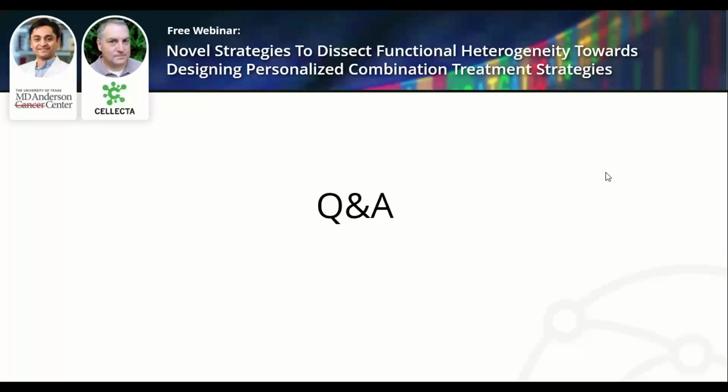That's great. Thank you very much, Sahil. So our third question is, how were the clones with specific DNA barcodes isolated from the bulk? Right. So the information we have is the specific DNA barcode for every clone. However, cells of course don't express that DNA marker. So there is no way, in a high throughput manner, to extract specific cells with a barcode.